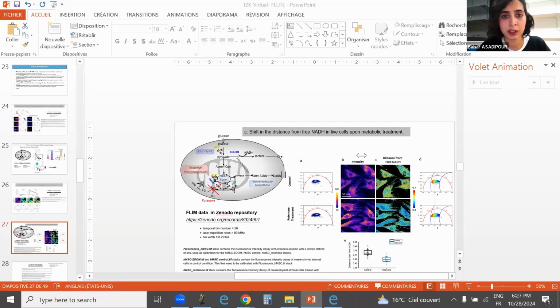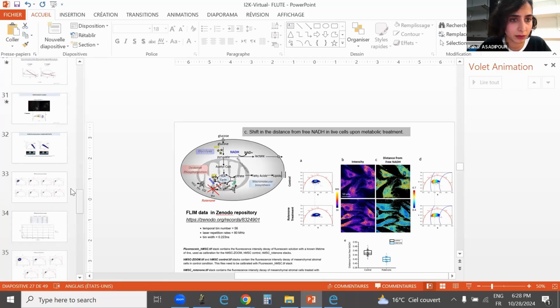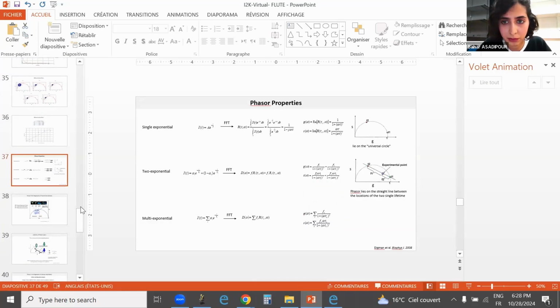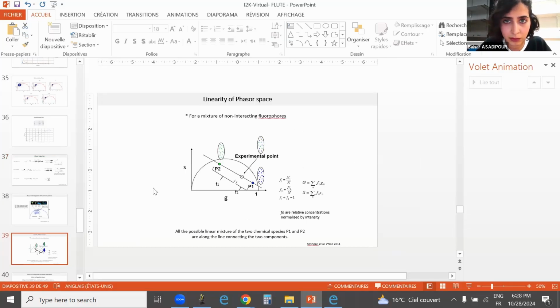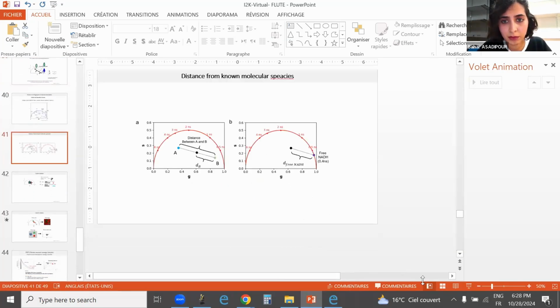Can you explain the definition of distance you just mentioned? Yes, maybe I can show you. Can you see this slide?